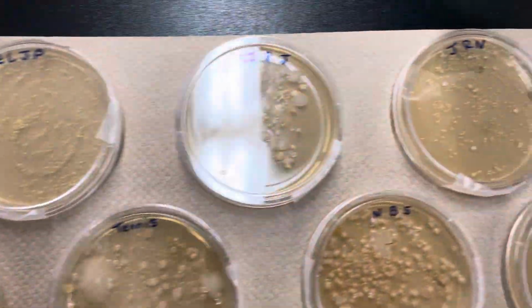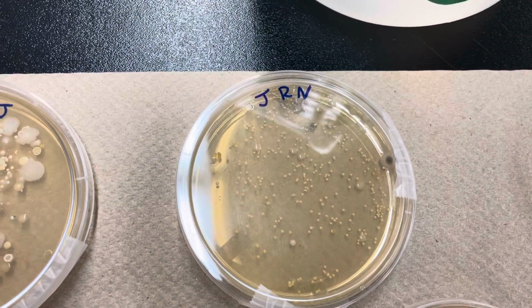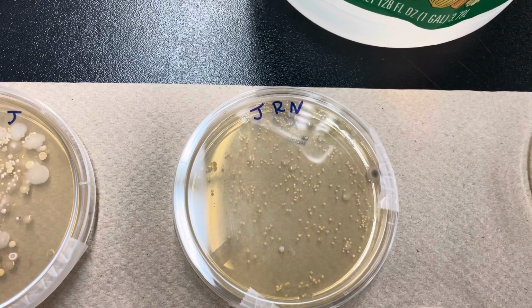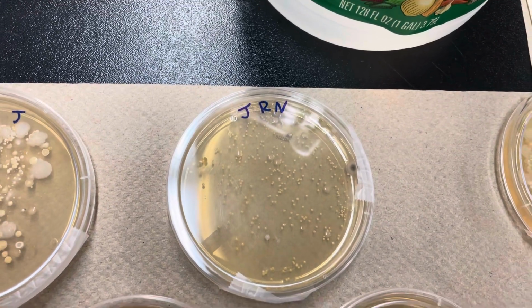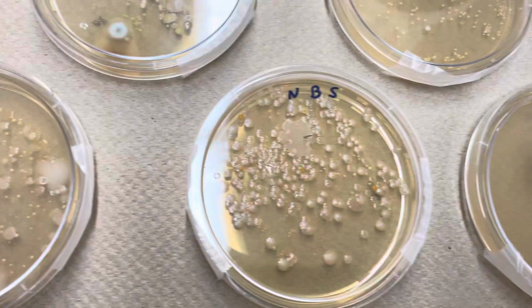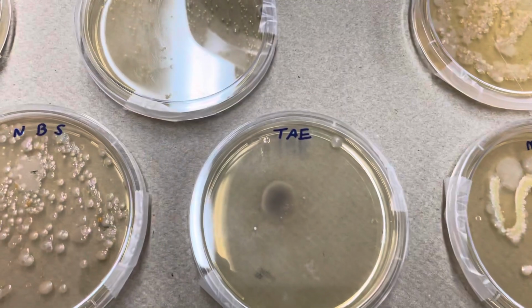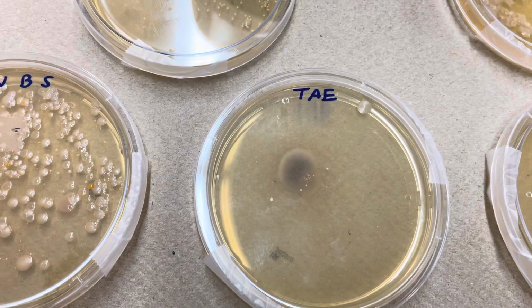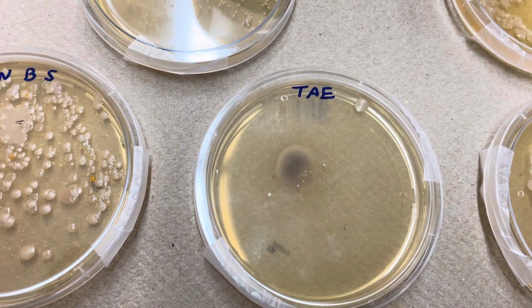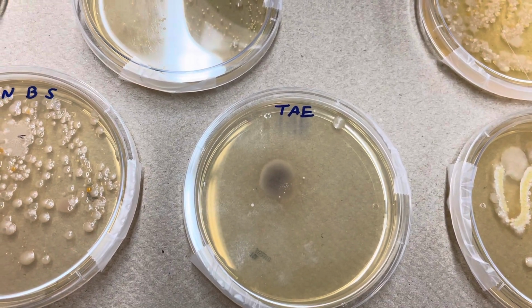So I asked the guys, where were y'all swabbing? And a lot of the seniors told me they swabbed their armpits. So something like this, it looks like I have all sorts of growth, but if that's an armpit, that's actually pretty clean. It's just one species that took over because of the medium, the agar. Same thing, it looks like I have all sorts of things growing. Again, that's only a handful of species. Like this here, that looks big and nasty, but that's just a mold. That's simply just one big mold. And in terms of biodiversity, it's still just one species. So it's like saying an elephant is big, a mouse is small, but it's still just one species, one elephant, one mouse, same concept.